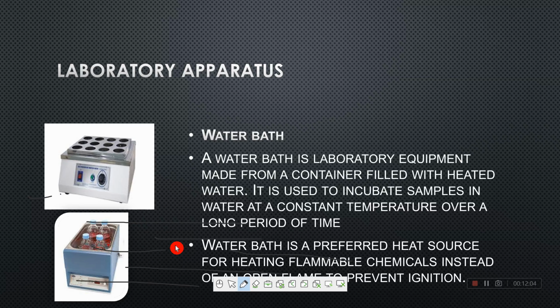Moving on, now talking about the water bath. A water bath is a laboratory equipment which is needed to heat fluid or any kind of solution, as well as for incubating the liquid or solutions. So for example, if any test requires a certain temperature to be reached, then we put the tubes or glass test tubes or the solutions into the water bath so that the temperature will be reached. So for reaching different temperatures, a water bath is used.